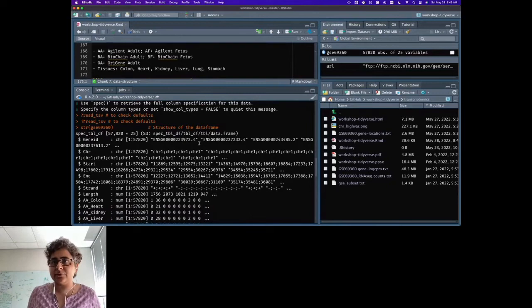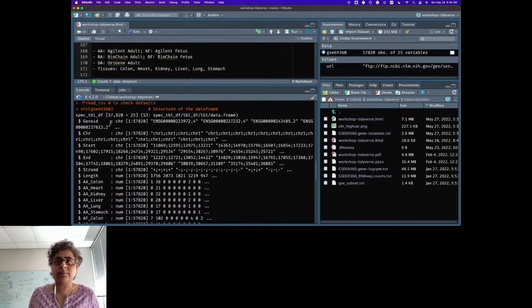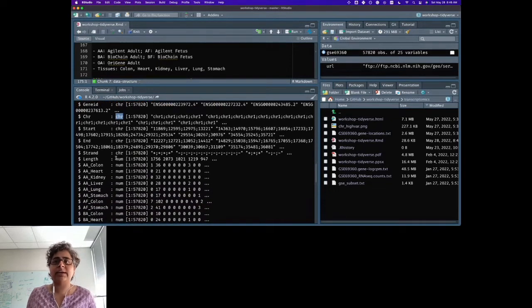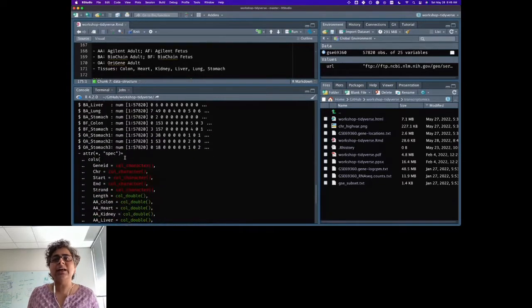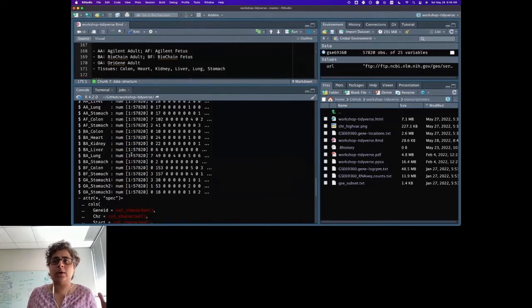It says this is a data frame, which is fair because we imported it with Tidyverse and it loads it in a data frame format. It shows you what the different columns are and what the data type is. It's either character or, in this case, numerical. But this is a little hard to read. Don't you agree? There are so many things going on here.